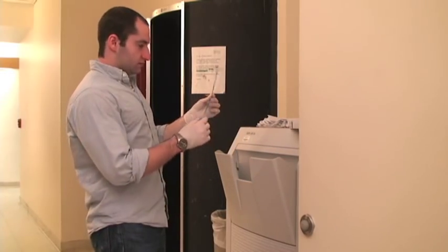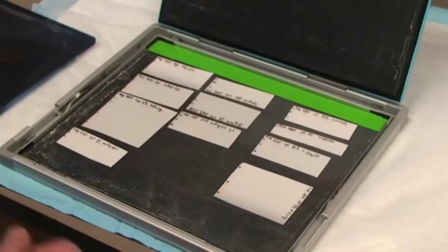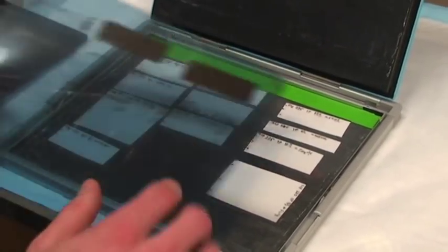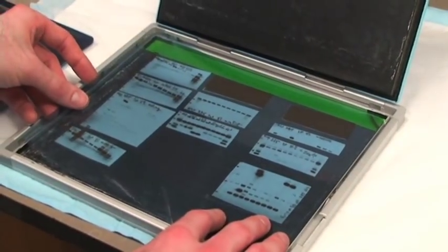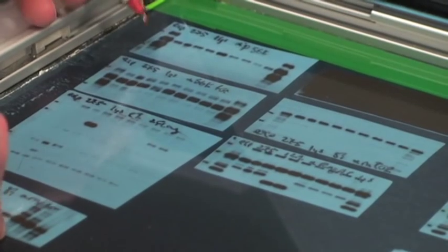The exposed film is then inserted into the developer, and what emerges is the final product of a Western blot, a piece of film where the dark bands represent binding of the primary antibody to the protein of interest, amplified by the secondary antibody binding, and converted into light signal in developing a blot.